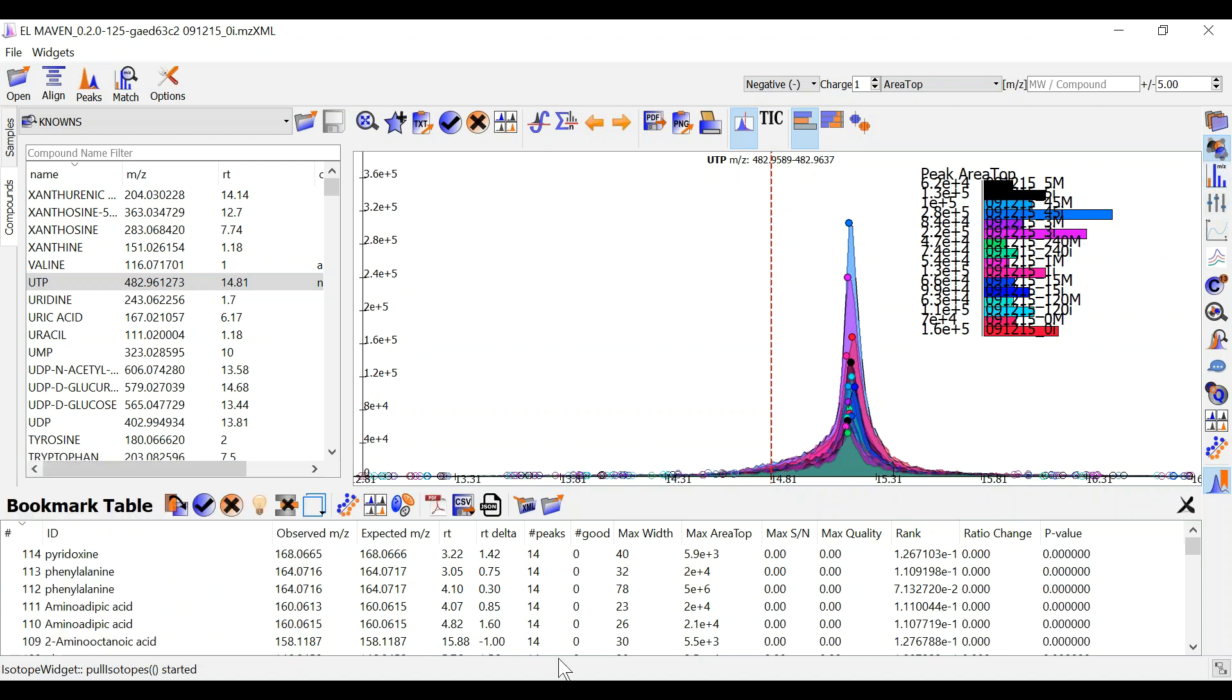Once this is done you can start curating your peaks. There are two ways to curate your peaks in this workflow.